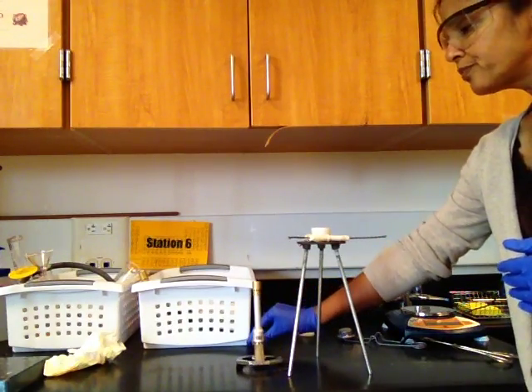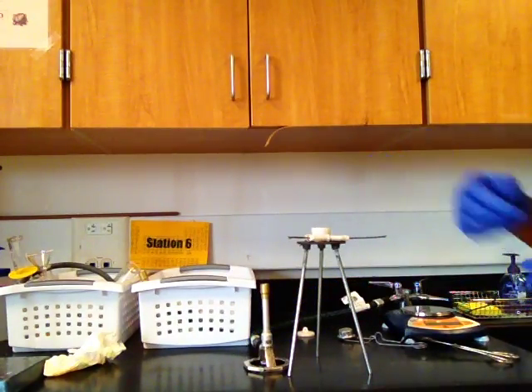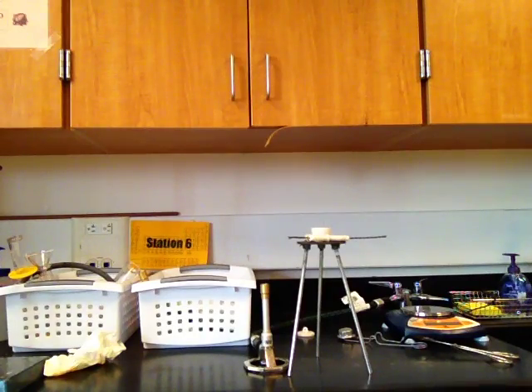Now what you do is, in this crucible, you put a sample of unknown hydrate. How much doesn't matter, maybe fill it about half the crucible. Take the mass of crucible and the hydrate. At this point, you are taking the mass of crucible and hydrate without heating it.